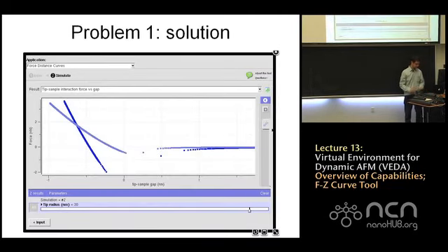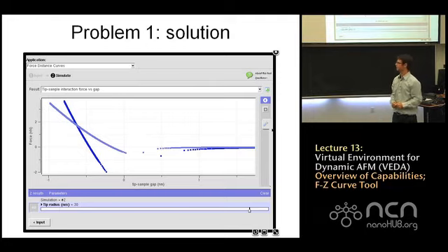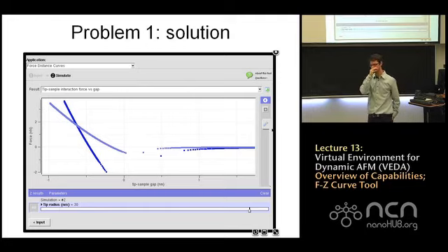So the result is, if you plot both of these curves, on my computer one of them is light and one of them is dark, but I guess it didn't come out well on the screen. What happens is the shallow slope line is where the tip is 10 nanometers, and the steeper curve comes from the tip being 30 nanometers.